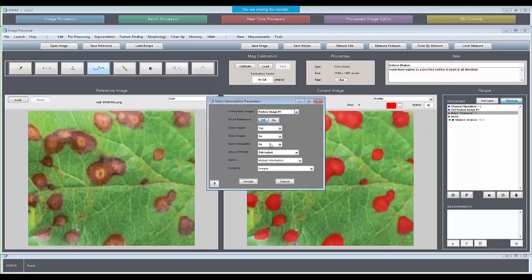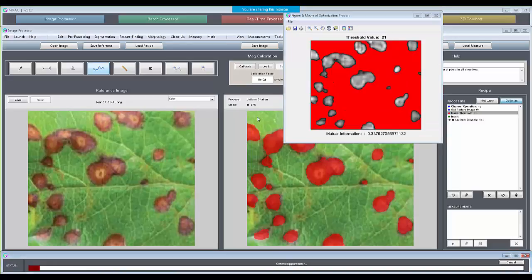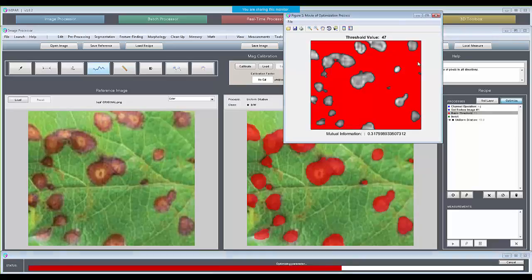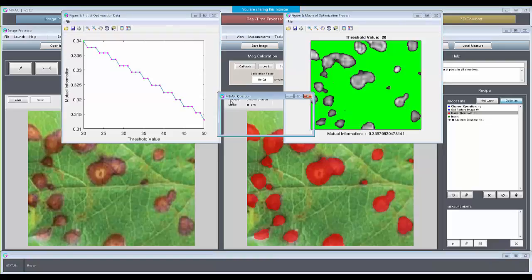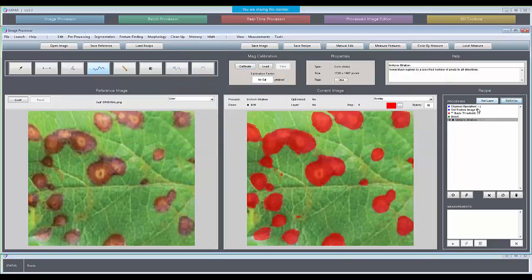It's deciding on the proper range here. This can also run more quickly if you turn off the display. So let me just let that finish and see if I need to extend the range further. I mean, of course, this also gives you a more objectively determined threshold value. I think we'd be pretty able to set the threshold level ourselves manually.